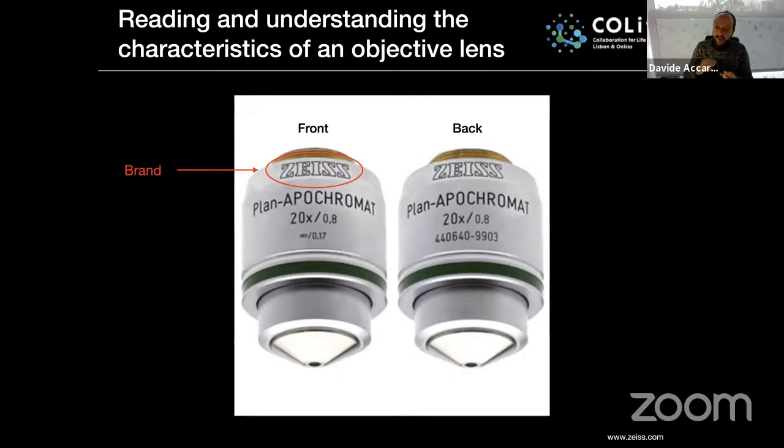They might be tuned at a certain distance to give a certain level of magnification, and there are differences between brands. So, for example, Zeiss compensates for chromatic aberration inside of the stand, but they have a different level of magnification inside. And then historically, Nikon and Olympus have full compensation for chromatic aberration inside of the objective, and many other differences. So always couple an objective of a certain brand with the stand of the same brand, unless you truly know what you're doing.